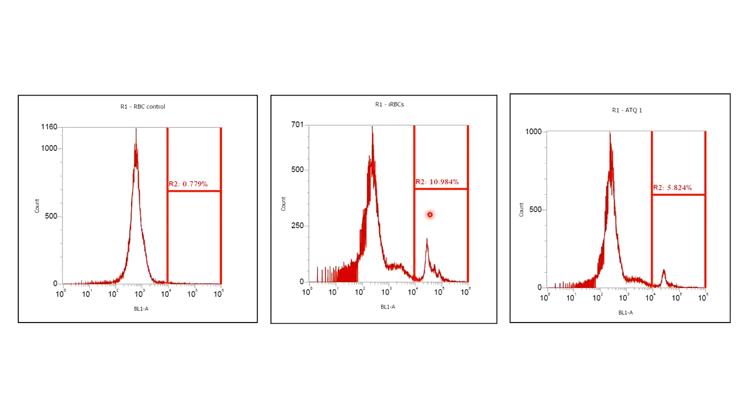How are you going to do that? You culture the plasmodium, put the drug on the plasmodium culture, and then you see whether they are dying or not.